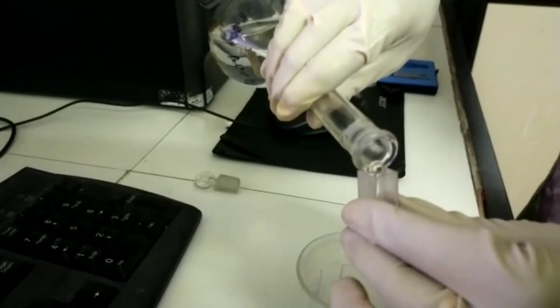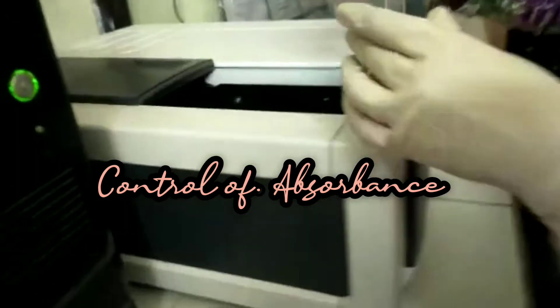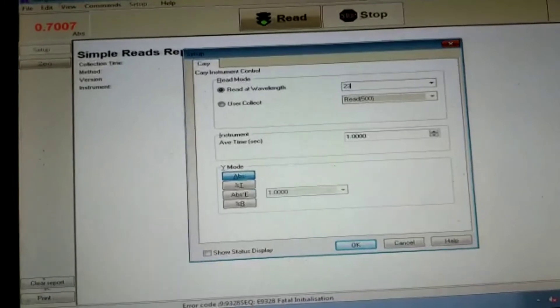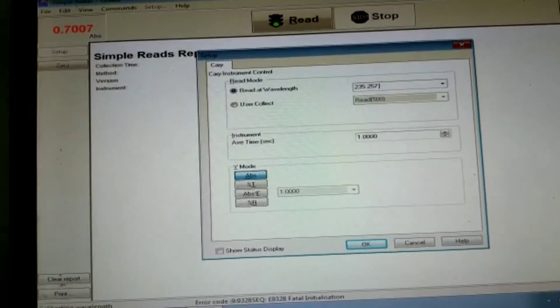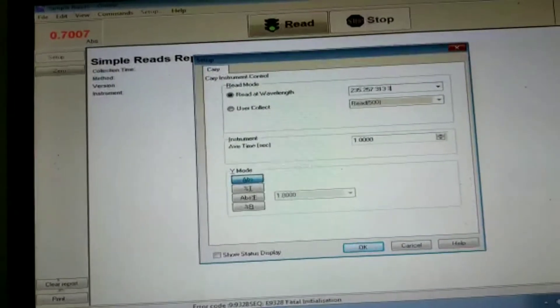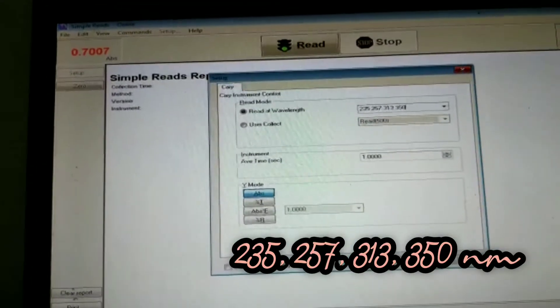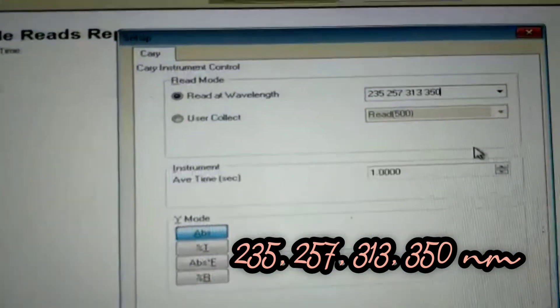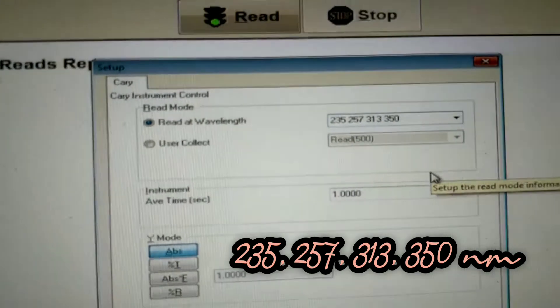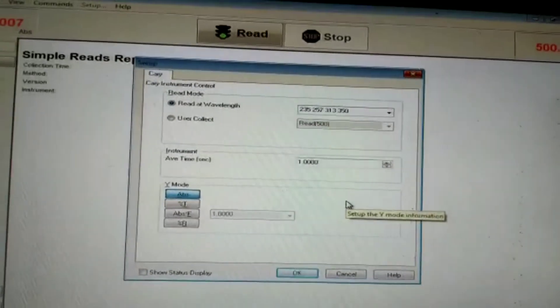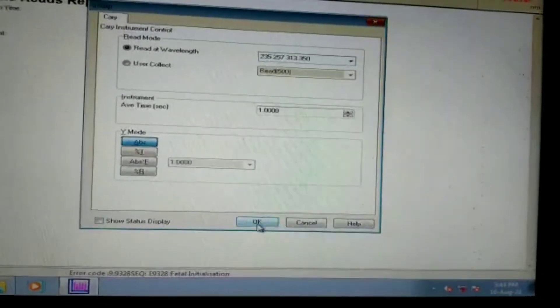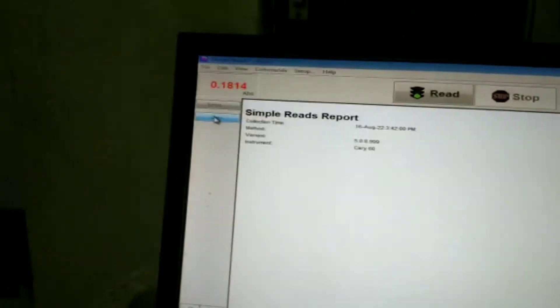First we will be checking the control of absorbance. For that I have placed the blank solution — 0.005 molar sulfuric acid — in the sample holder. I have opened the software and kept it in simple reads mode, then selected absorbance and typed the required wavelengths: 235, 257, 313, and 350 nanometers. Then I press OK and will first set to zero with the blank.